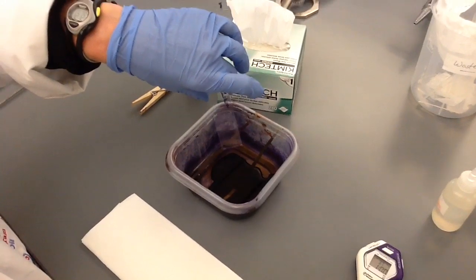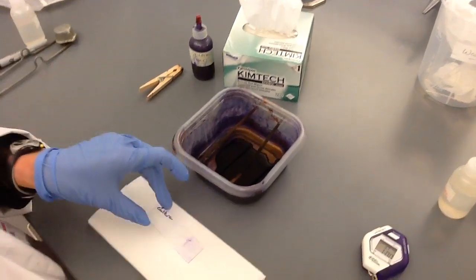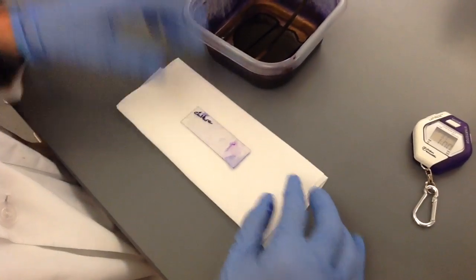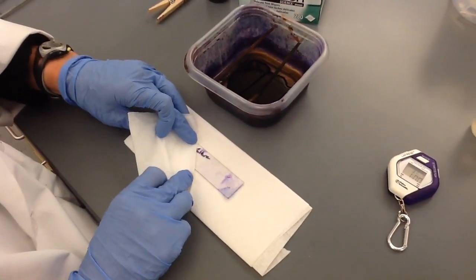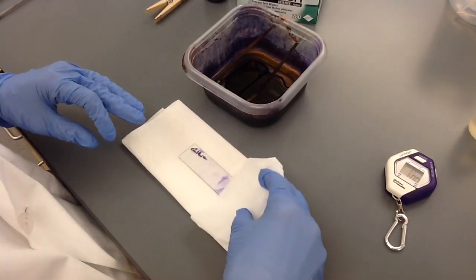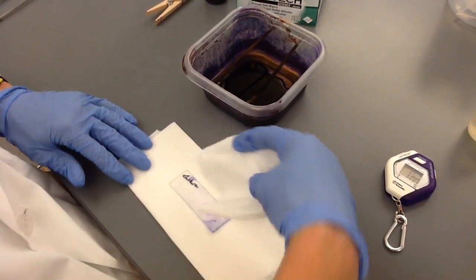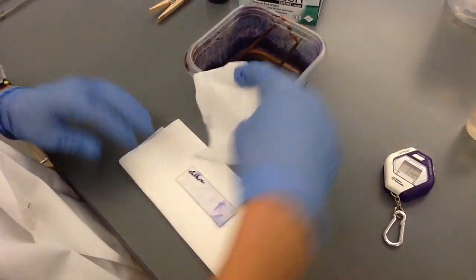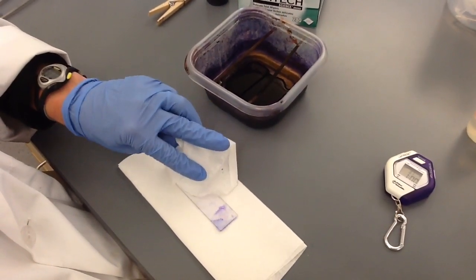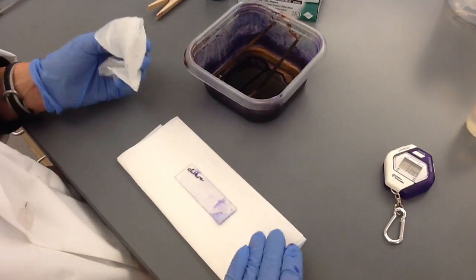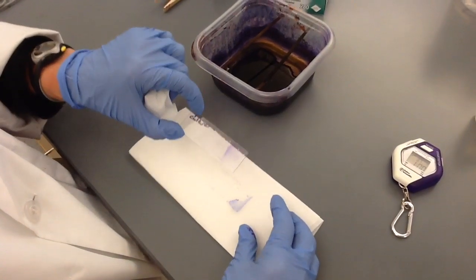You've now got a stained but wet slide. Set it down on a paper towel. And you can very gently wick and blot with a Kim Wipe. You don't want to rub the Kim Wipe because then you'll rub your stained cells off.